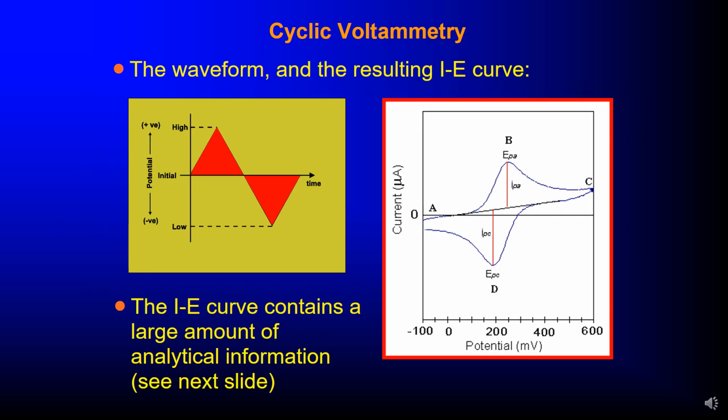So as you can see, the wave and the resulting IE curves. The IE curve contains a large amount of analytical information.